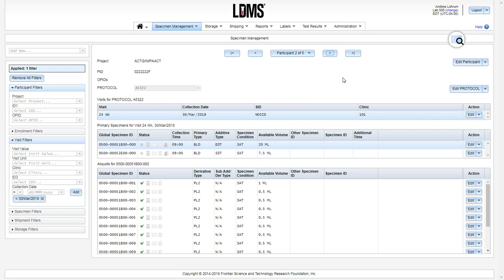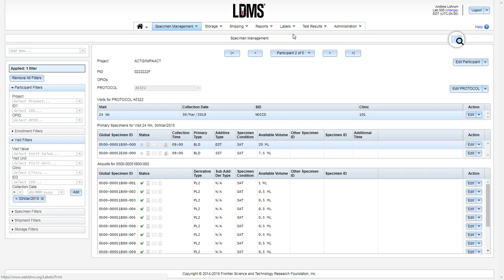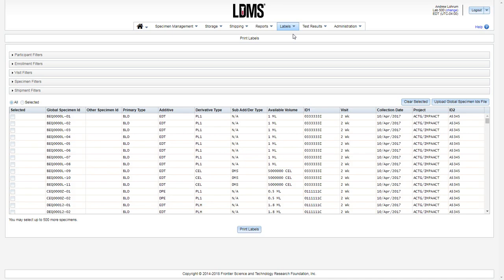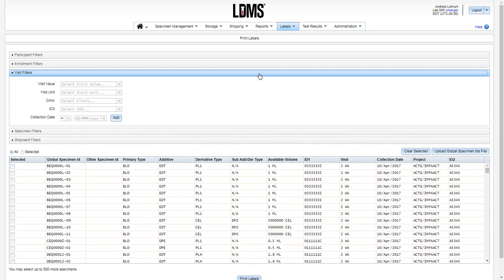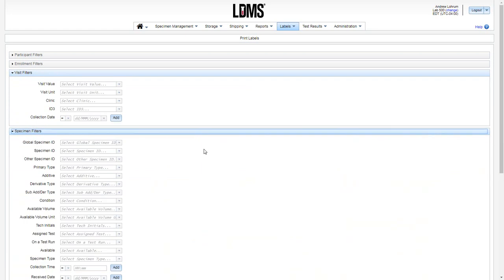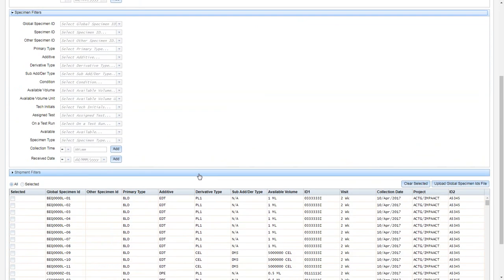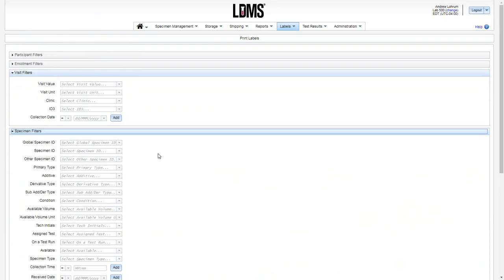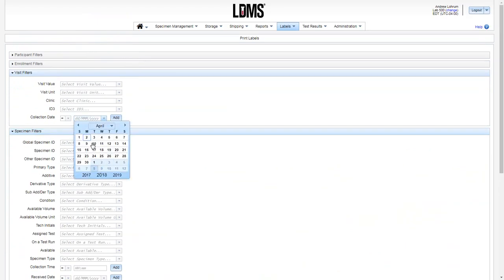You also have the ability of using our labels module. Clicking on the print label page, apply a date filter, again either under visit filter or under specimen filters. Choose the received date or the collection date.